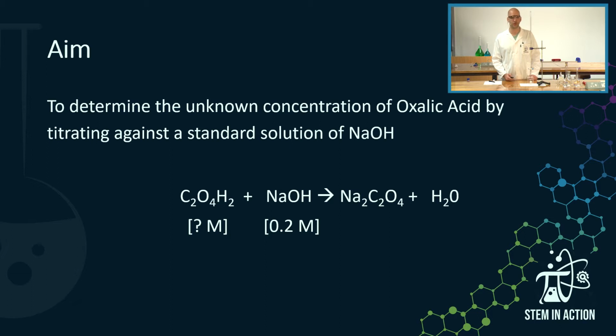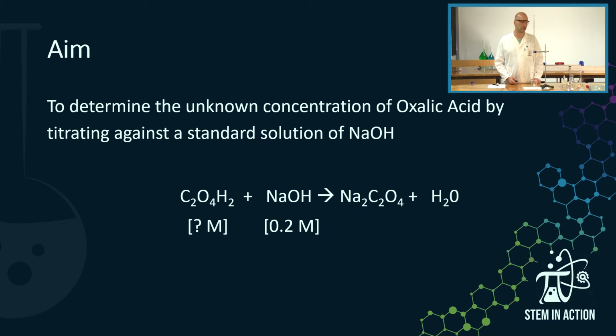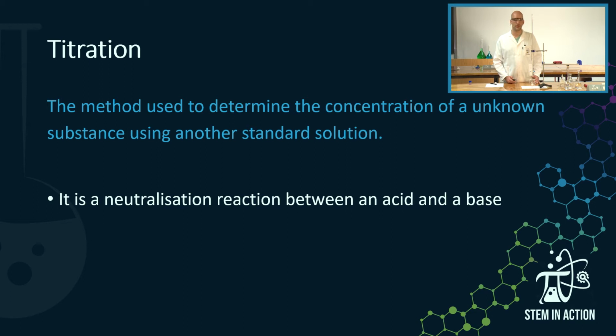So there's the basic formula for the reaction, and as you can see, we want to determine the concentration of oxalic acid, and we know what the concentration of sodium hydroxide is. The definition for titration is as follows: the method used to determine the concentration of an unknown substance using another standard solution. Titration is also a neutralization reaction between an acid and a base.